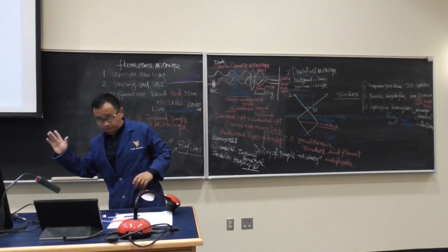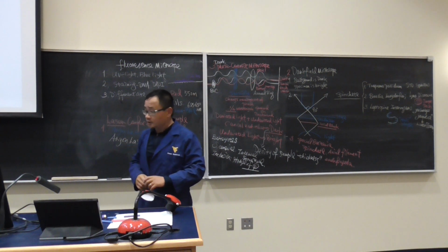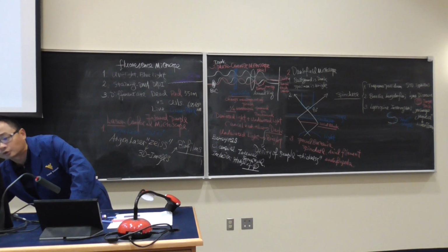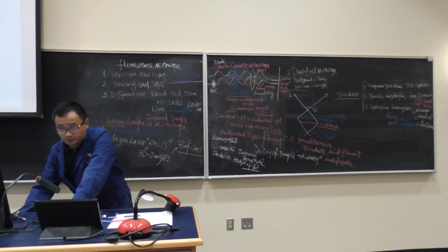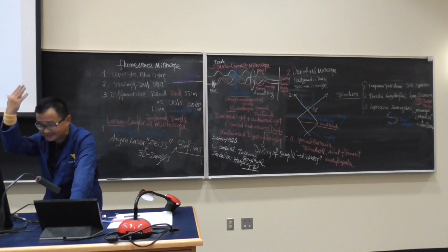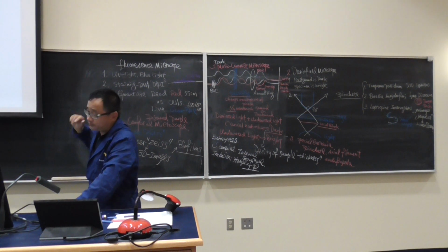It's about the biofilm, to see how the chlorine solution kills the bacterial cells. So you can see the first image. Most of these are green color. It is live. Then you see the color spectrum there, with the x-axis and the y-axis. The x-axis indicates the green color. It's all live.